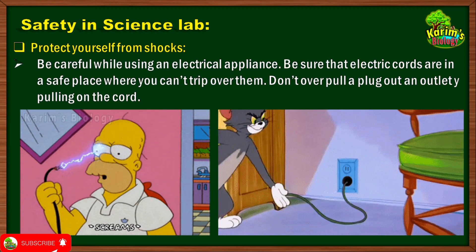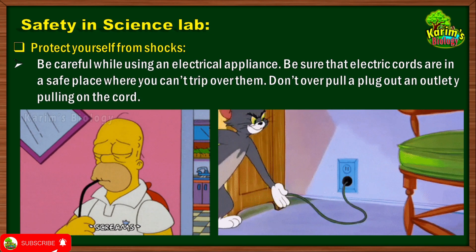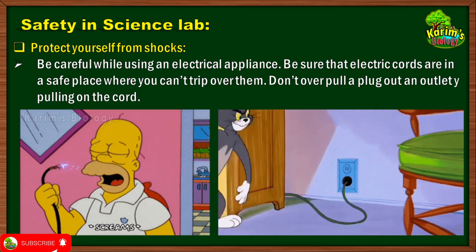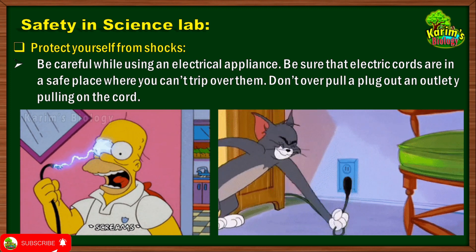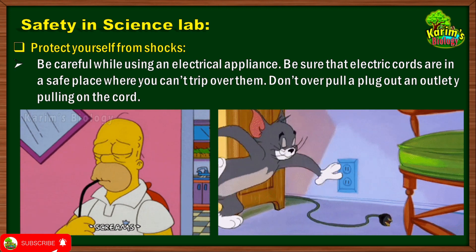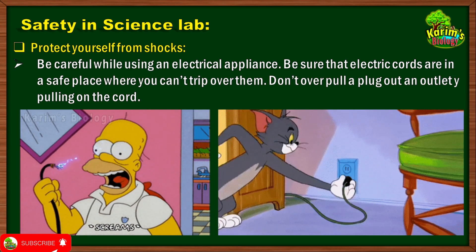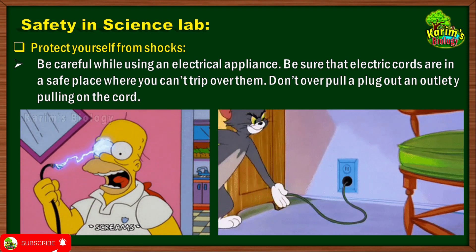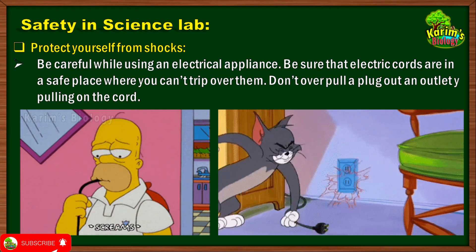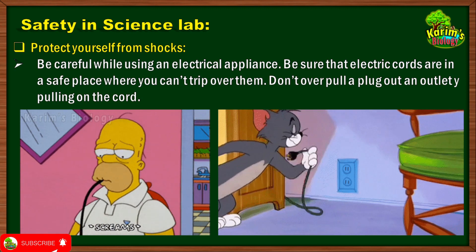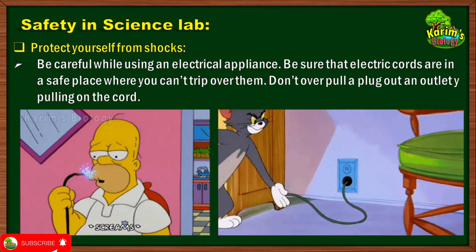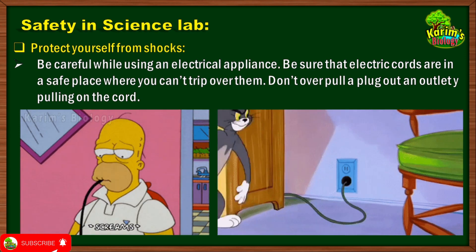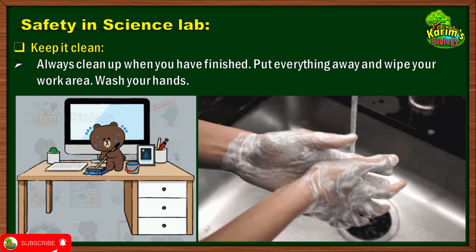The next safety precaution is: protect yourself from electrical shocks. Some apparatus in the science lab work by using electricity — for example, a centrifuge machine or an electronic weighing machine. You must be very careful when working with electrical appliances, especially at the plug socket. Without informing your teacher, you should not pull any electrical cord from the socket or pull any wire, as there is a chance you may get an electric shock.